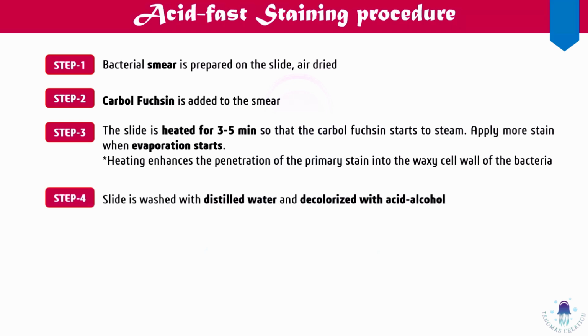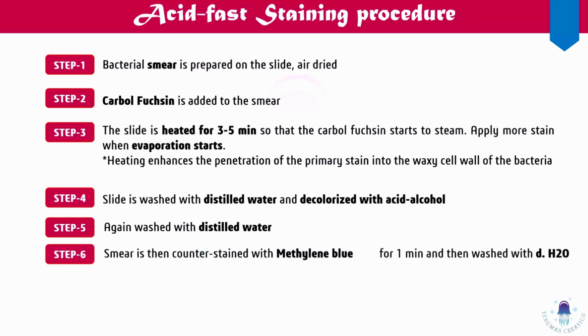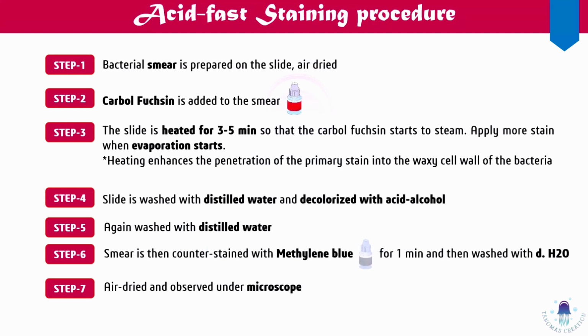Then it is washed with distilled water and decolorized with acid alcohol for 1 minute. Again it is washed with distilled water. After that, methylene blue is applied for 1 minute and after that it is washed with distilled water. Then the smear on the slide is air dried and observed under the microscope.